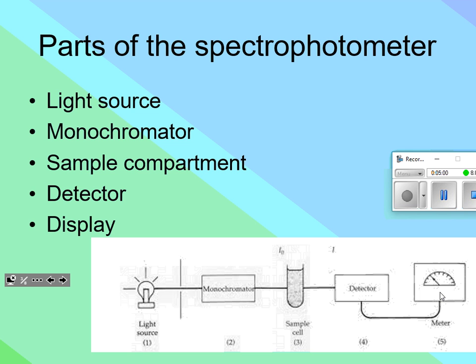Again, thinking about all these parts here, when you look at these two solutions right here, which one appears to be more concentrated? The one on your left or the one on your right? The one on your right. Seems like it's darker, doesn't it? It's actually the exact same molarity for both, though. It's just that you are looking through, passing through, a lot more solution.